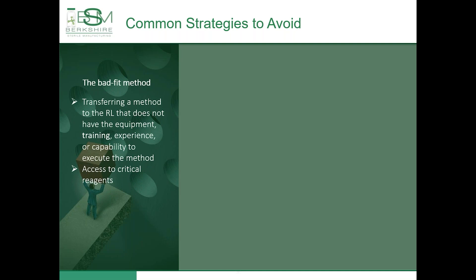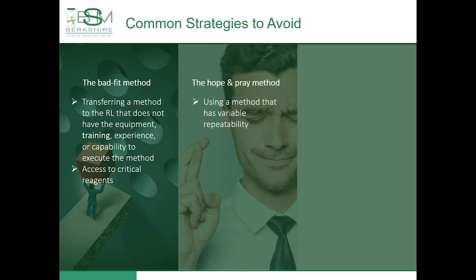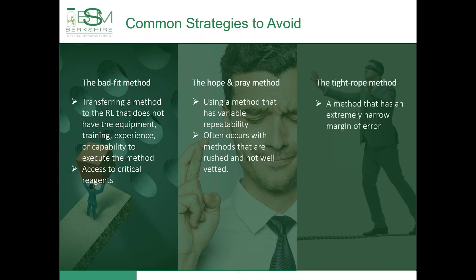Another common strategy to avoid is the hope and pray method. This is using a method that has variable repeatability and often occurs with methods that are rushed and not well vetted. The final common strategy to avoid is the tightrope method. This is a method that has an extremely narrow margin of error and requires extensive analyst training to perform correctly. We typically see the tightrope method fall into play when there are several steps involved, small volumes of material are used, or the criteria are artificially too tight to fall within a very close range to their target specification. In these types of methods, any small deviation would result in a failure — similar to how one wrong step could cause a tightrope walker to fall.